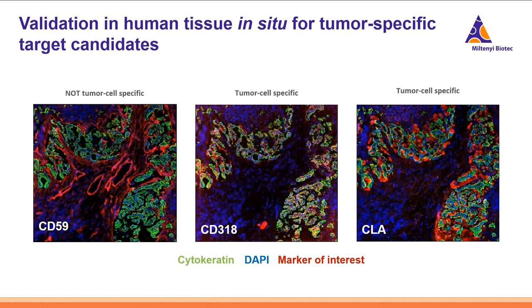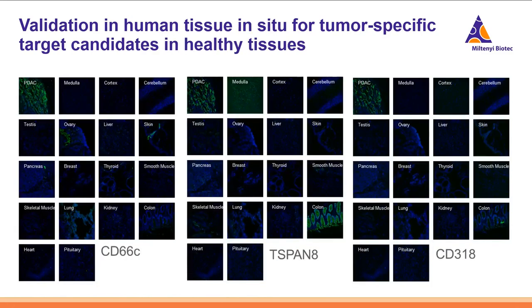On top of that, we can also have these images to look at the different morphology and have that as part of our decision-making process as well. So in combining the mixed information along with other flow cytometry data, there were four particular targets that showed high expression levels on the specific tumor location.